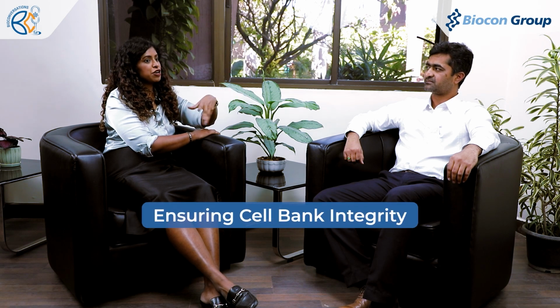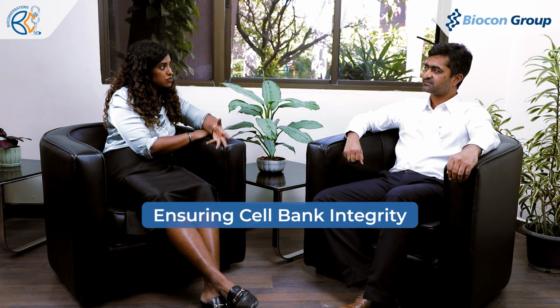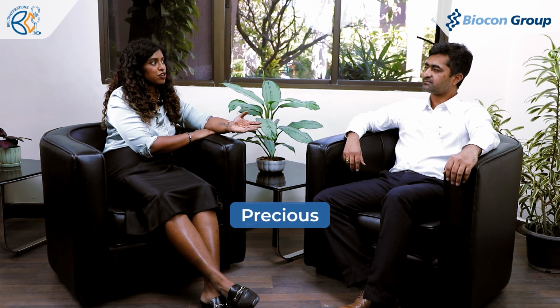So how do you ensure the integrity, considering your entire batch or the product that comes out of these cells is so precious and expensive? So how do you ensure that the integrity of these banks is maintained? Yeah, essentially, it's a long procedure. It is not a few days or a few weeks. So cell bank preparation will happen.